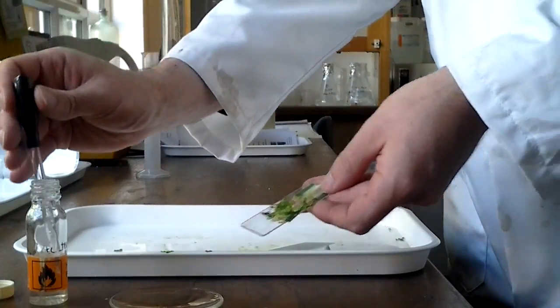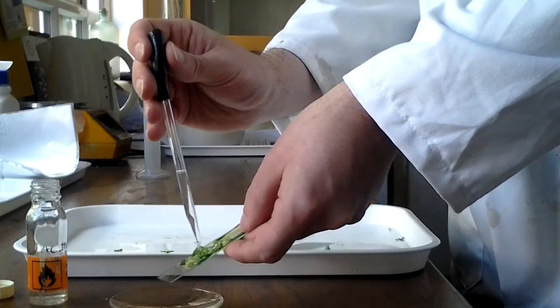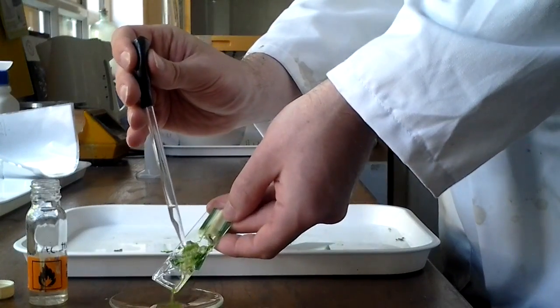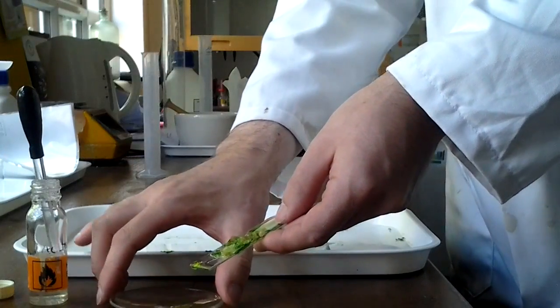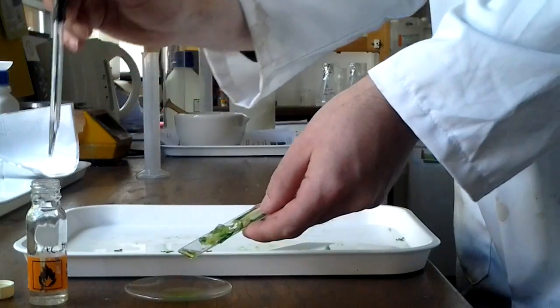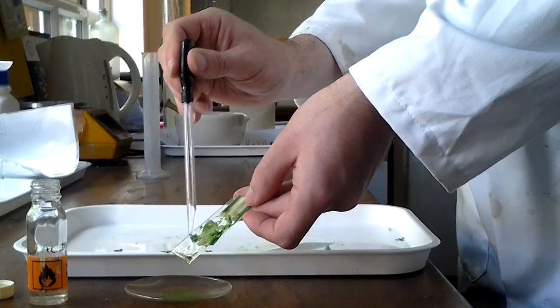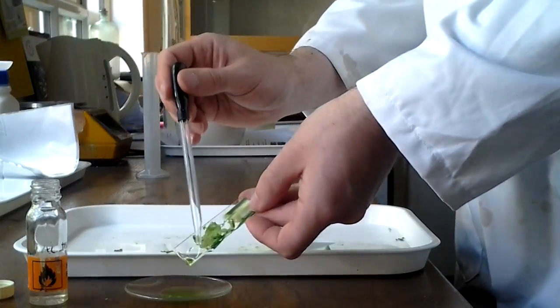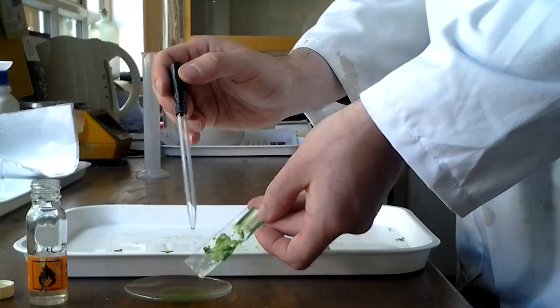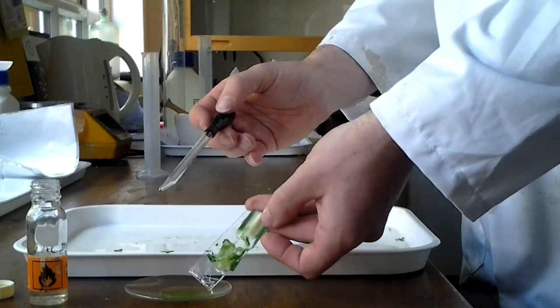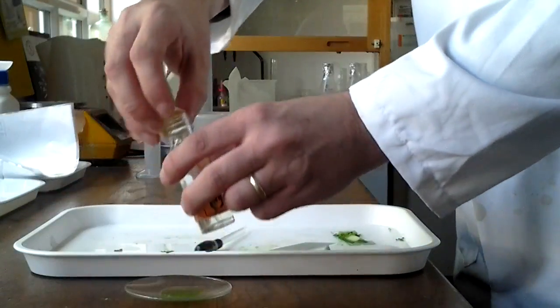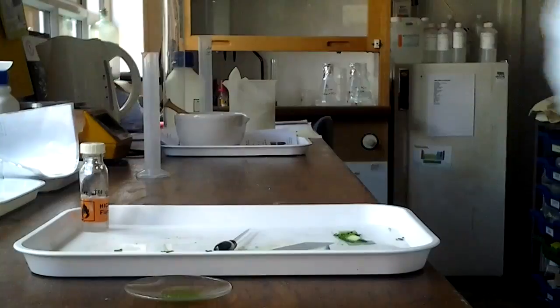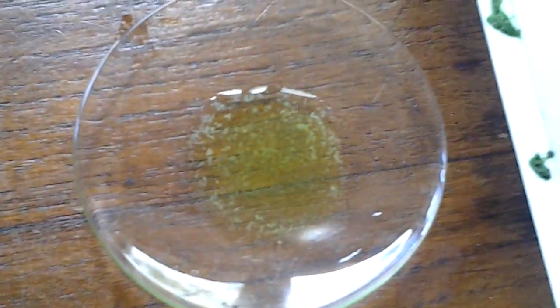So take a pipette full of that and rinse the mushed up plant from the slide into a watch glass, which I have positioned here. I'm going to do a couple more of those, just to get as much green stuff in as possible. We're trying to avoid getting too much solid material in at this stage. I've got a mushed up plant that we can discard, and put the lid back on the acetone. I've now got a nice watch glass full of kind of greenish liquid.